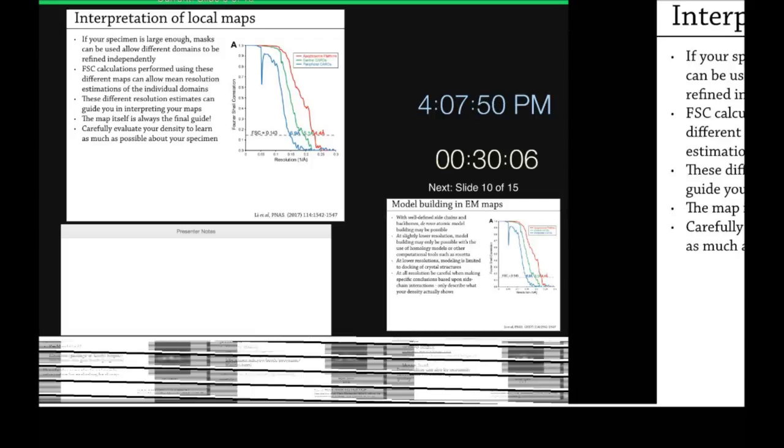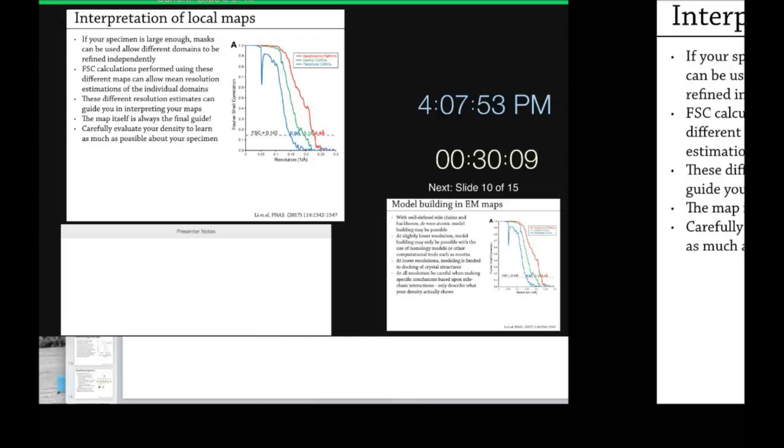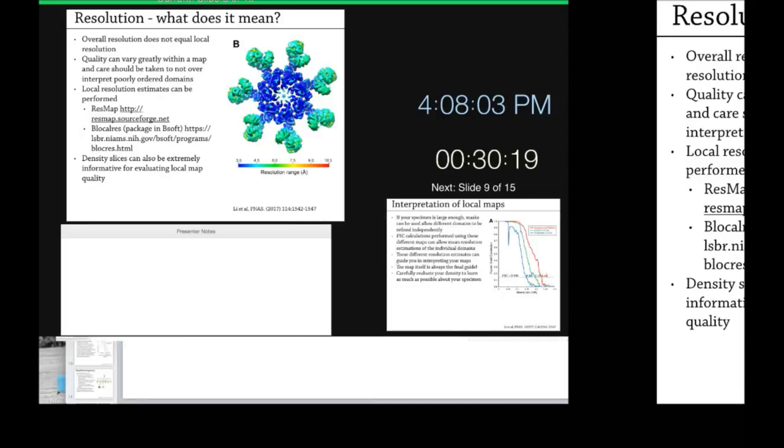So you could make local conclusions regarding individual side chains, but only within that one particular context. You couldn't actually fit it into the overall resolution. Right, that's where you have to be careful. Say you have a lysine that would be sitting here that might form a salt bridge with this portion over there. Because you know this domain in different subunits is going to be in different positions, some fraction might have that salt bridge, some fraction might not. And so that might be biologically relevant, but you're going to have to get additional data that is orthogonal that can help you make that conclusion. Does that make sense?